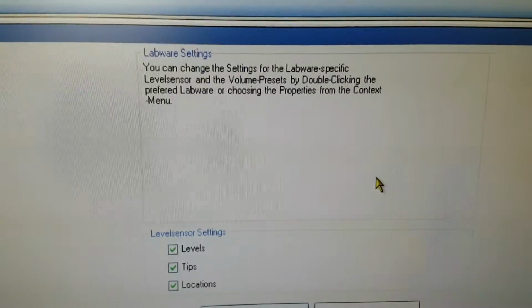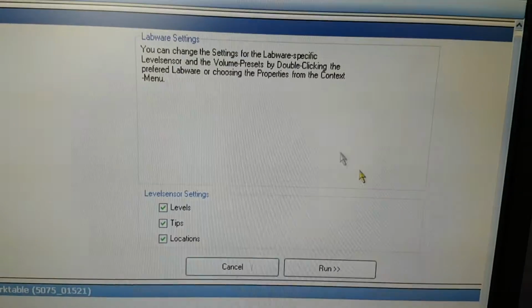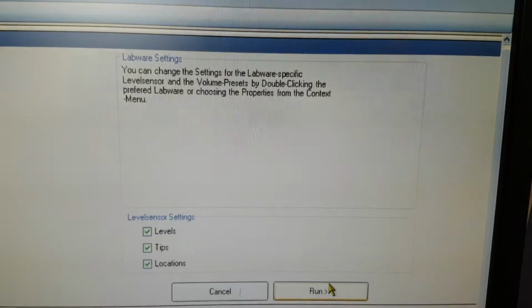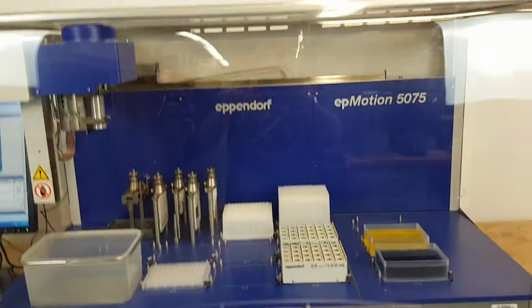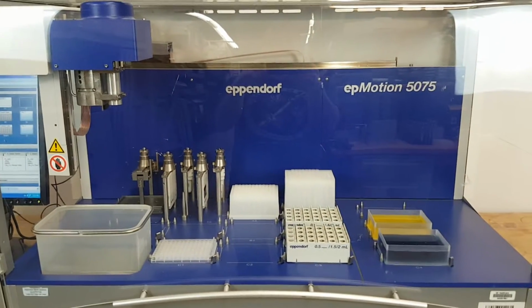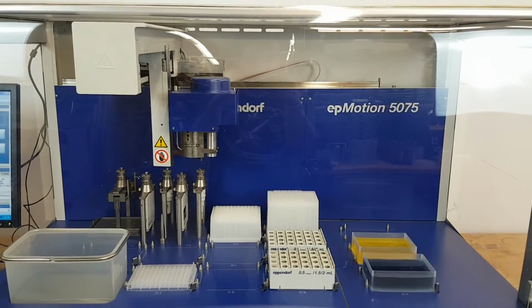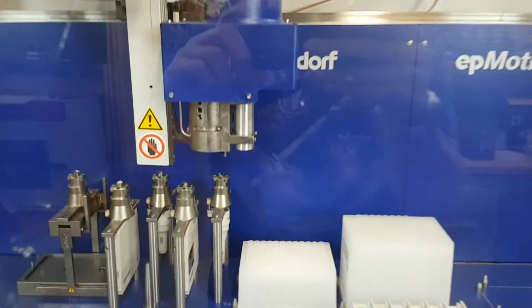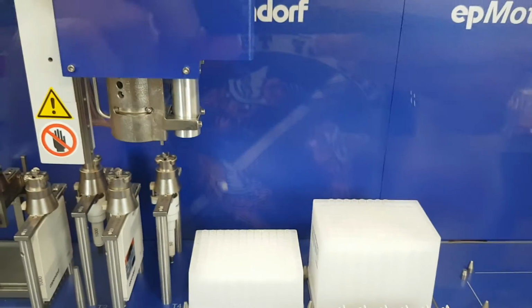And now it's asking us if we want it to check. So I'm gonna have it check everything, including the levels. That'll take a little bit longer, but it is worth it to show you that everything is working. So now it begins its check. It's currently searching for the pipette tips in the pipette box.